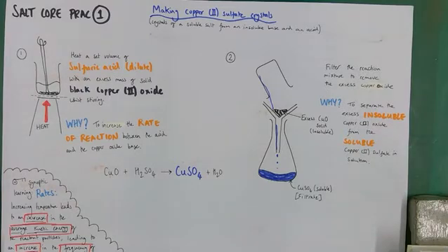Initially upon stirring, the reaction rate is very slow, so we heat the mixture with a Bunsen burner on a blue flame to increase the heat energy transferred to the reaction. This increases the reaction rate.